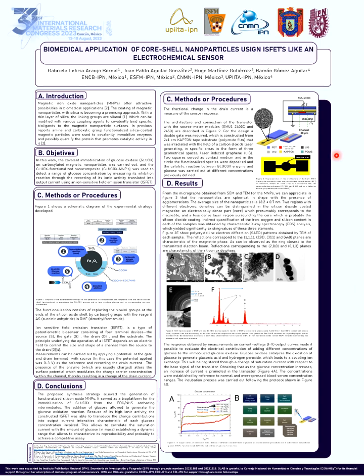Then, the ISFETs were characterized by connecting them to source meter models, applying a source-drain voltage from 0 to 3 volts, while the gate voltage is kept fixed at 1 volt. This generates current curves for each concentration of glucose in aqueous solution.